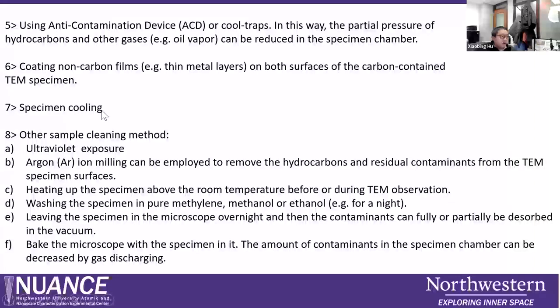Also, you can do your experiment under a cooling condition. You can use a liquid helium holder or cryo holder. I mean, you can cool down your observation temperature, then the contamination will be reduced. Of course, there are many other ways. For example, you can use ultraviolet exposure, this UV light, on your sample for more than 10 minutes, using the energy of the light to remove the contaminants.